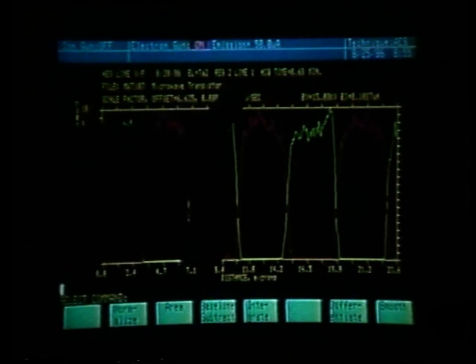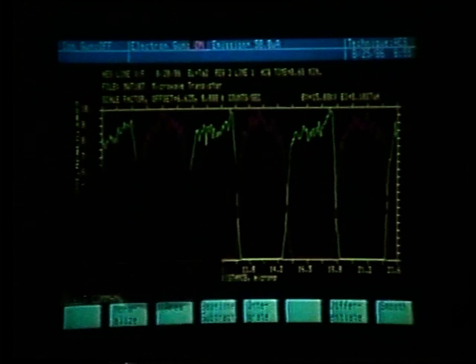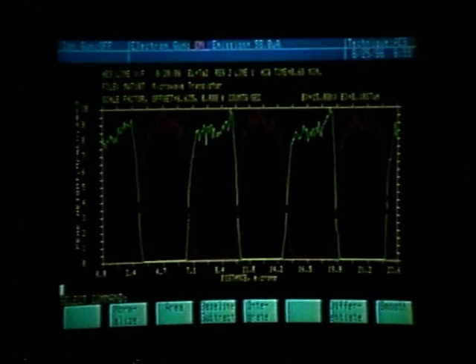We also have the information in the graphics display on the top that it is line number 1. What I would then like to annotate is that the line scan should be referred to our lines which we superimposed on the SEM map, which was photo 106.